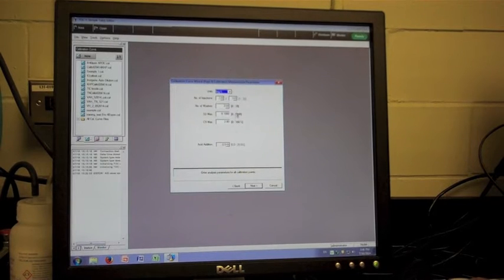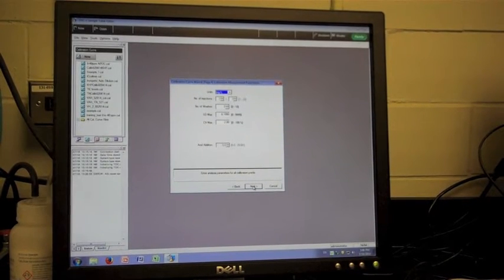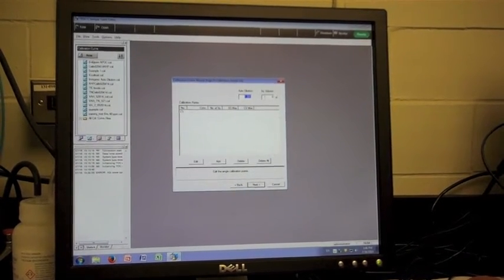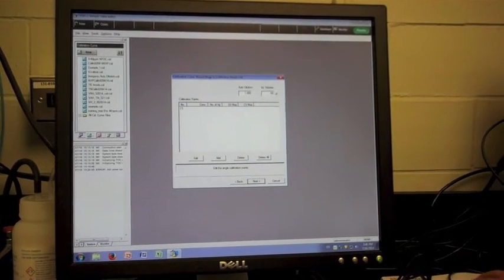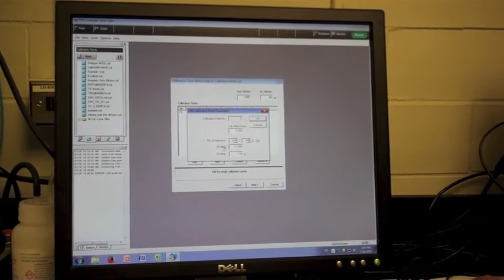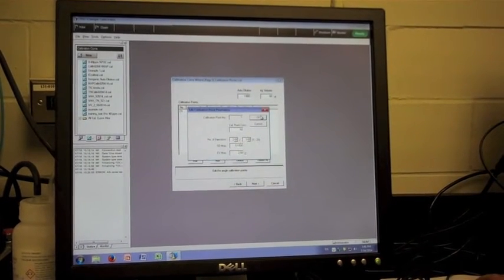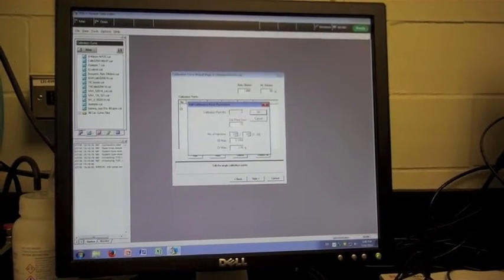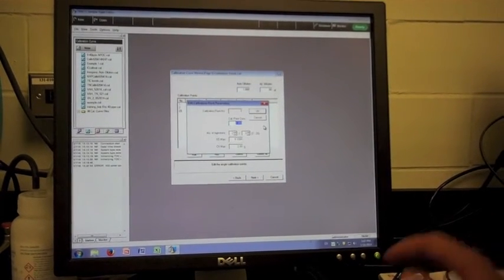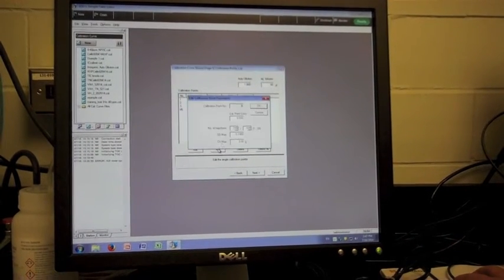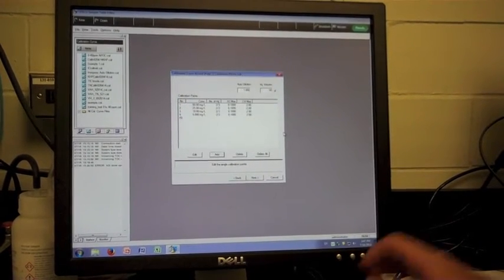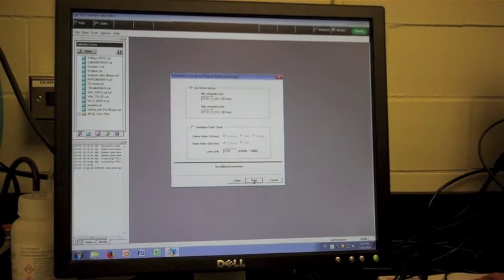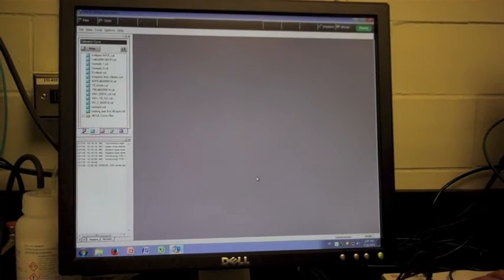In the following window, you have the option to adjust the number and size of washes and injections if desired. In the next window, add a calibration point for each of the standards of different dilutions being placed in the machine. It is best to assign these known standard points in order of ascending concentration. In the top right corner, also add the injection size desired for the standards. For most standards, consistently using injections of 50 microliters is recommended. You have now successfully completed the programming of the calibration.